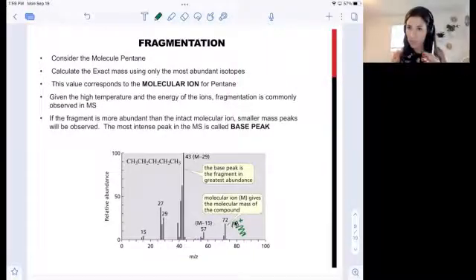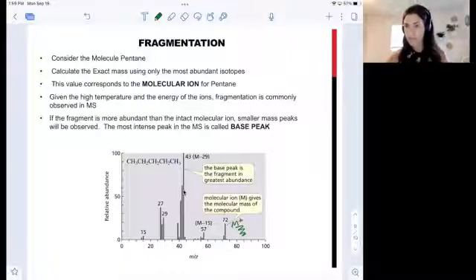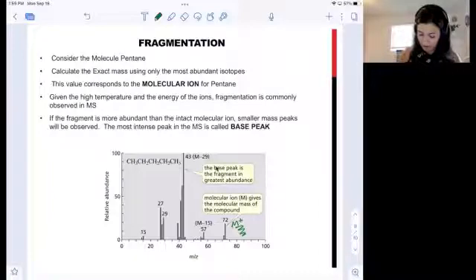So remember, we're generating ions, which are less stable than neutral molecules. So in the mass spectrometer, these ions can quickly decompose or break down. And we see these fragment masses for the pieces into which they break down. The base peak is referred to when you have a peak that is taller than the M plus itself. So the tallest fragment is typically called the base peak.